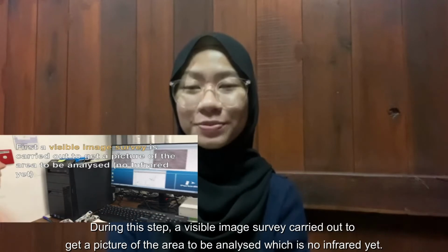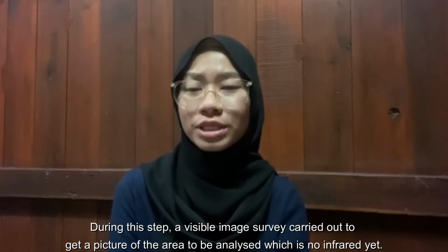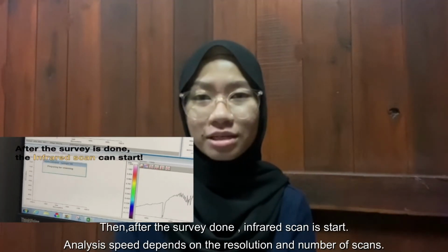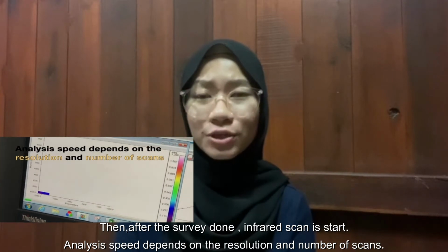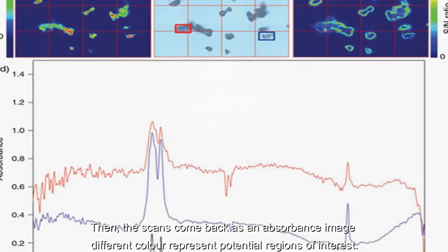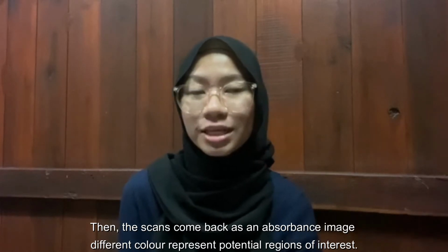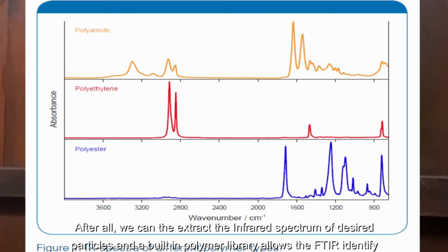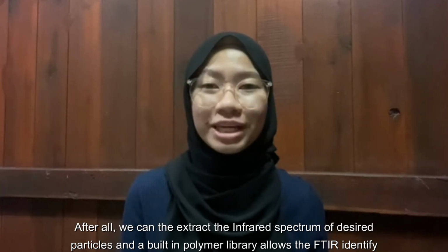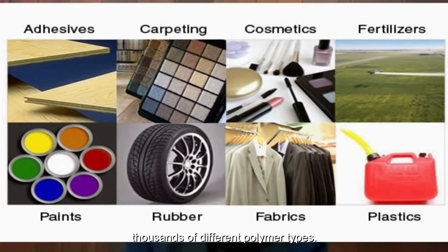During this step, a visible survey is carried out to get a picture of the area to be analyzed, which is no infrared yet. Then, after the survey is done, the infrared scan is started. Analysis speed depends on the resolution and number of scans. Next, the scans come back as an absorbance image. Different colors represent potential regions of interest. After that, we can extract the infrared spectrum of desired particles. A built-in polymer library allows the FTIR to identify thousands of different polymer types.